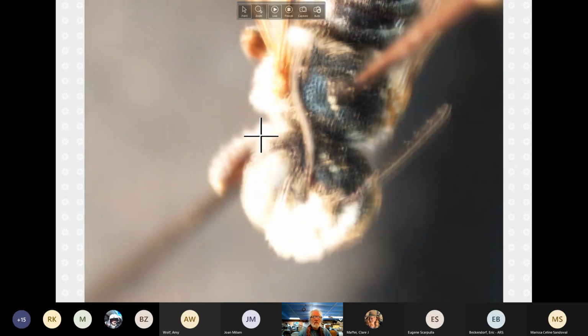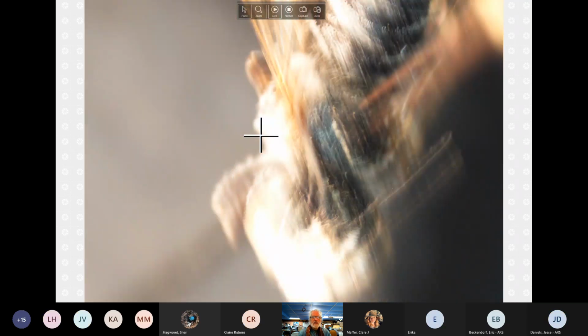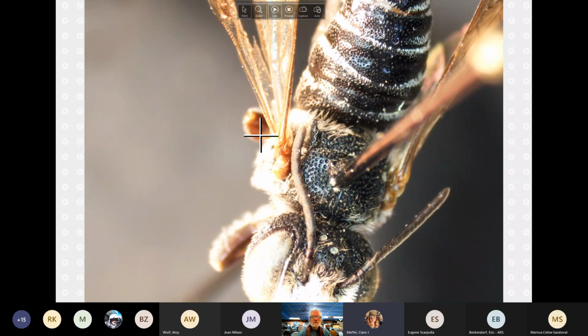But it just seems like we're in a slow refreshing rate here. There's also the live blur selection, but I think you need to have that selected to be casting anyway. Yeah, I clicked the live, but it's something else. Okay, sorry. We'll ignore it for now. Maybe at the end we'll play with it.